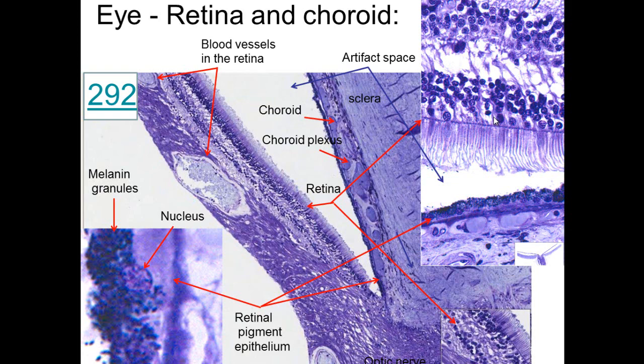defocus the image or disturb the image because it is absorbed. Now, if this was a nocturnal animal, it would not absorb light. It would reflect light because it would not be pigmented in certain areas. That's what's reflecting back from the eye, that you're seeing through there. And there's actually another connective tissue, tapetum lucidum, right in through there. We don't see it in humans, but it'd be another little layer in through there that reflects back to let a lion be able to see at night. Not well, but better than not seeing at all.